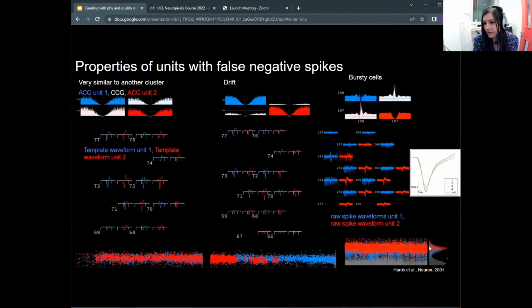And finally, the spikes would be present at the same time, but again, one of the units' spikes would have a much smaller amplitude and might have this waterfall look to it, where each spike in the burst has a lower amplitude.